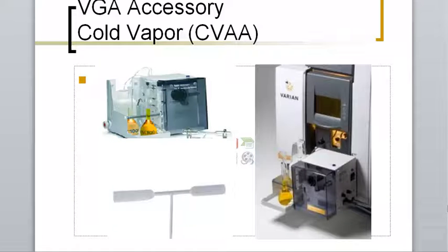All right, so the cold vapor attachment traditionally would look something like this. This is what sits on the front of our Varian instrument, and it's also what would sit on the front of many other AA instruments as well. And you can kind of see the pieces and parts here. So here, maybe the more front view of the attachment itself, I see a bar, and there's a space in front of the bar, and that space is meant for you to put your sample down, so that way you don't get them confused with each other. So here is my sample intake, and I have a tube that goes down into that sample, and that tube will suck up that sample that should maybe contain mercury into the mixing chamber.